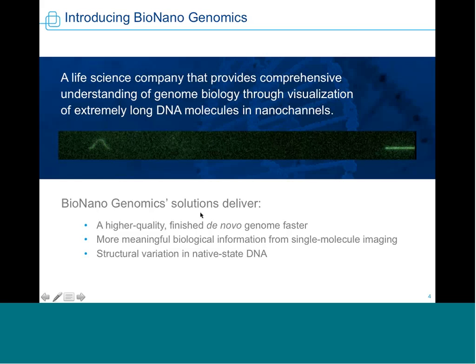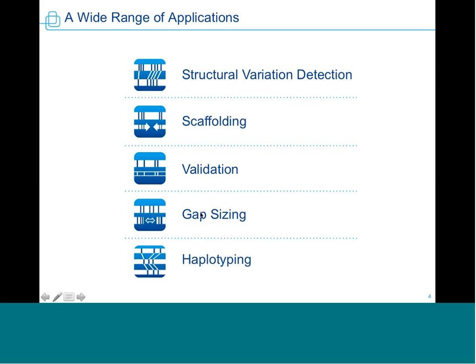So here, one of the key features of our technology is that you can collect many images over multiple cycles from your sample. And so the idea here is you can turn the voltage on, pull in a sample of molecules from your DNA sample, take a picture, and flush the rest to waste and bring in the next batch.